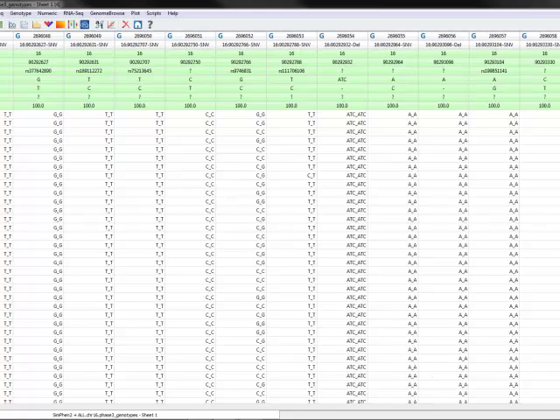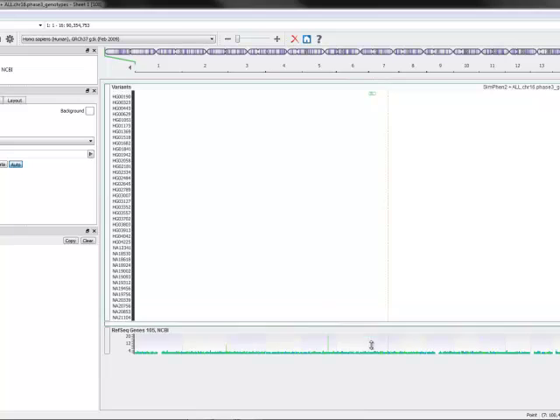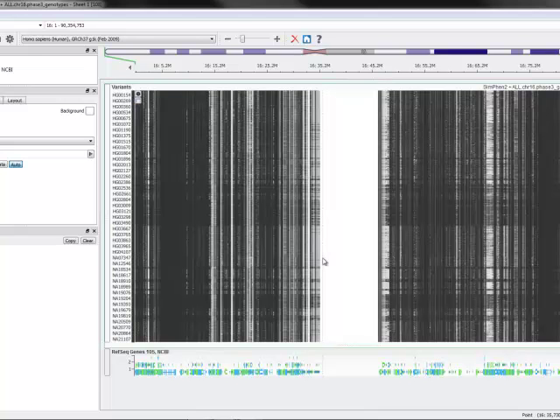Now, as I'm exploring data for the first time, I often like to see it visually. And one of the nice things in SVS is that I can just click a button here and launch the Genome Browse visualization environment. And here within Genome Browse, if we go directly to chromosome 16, where the data is, what we see to begin with is essentially a density plot, giving us some idea about where the variation occurs within the data. So darker colors indicate a lot of variation, lighter colors, little or none. Of course, we have a large centromere region here on chromosome 16.